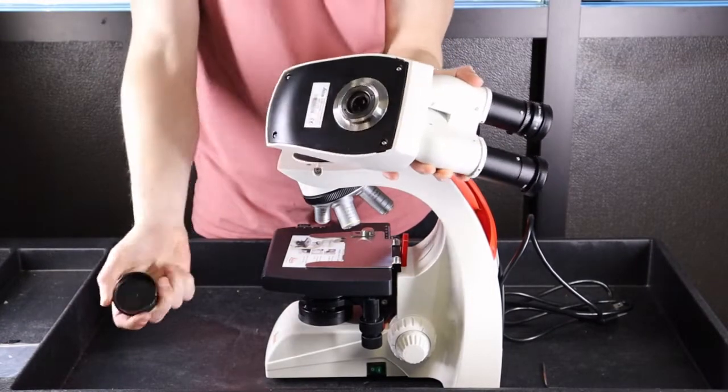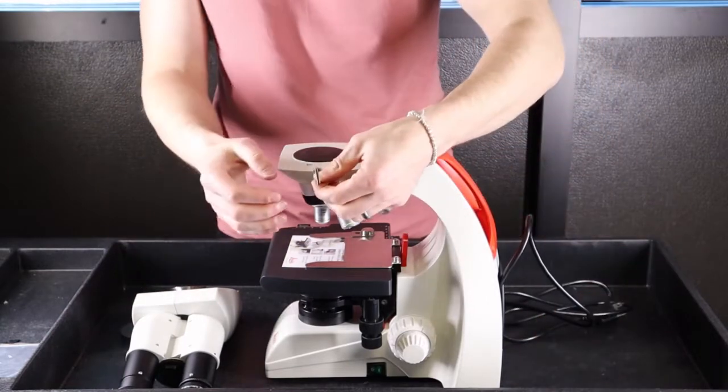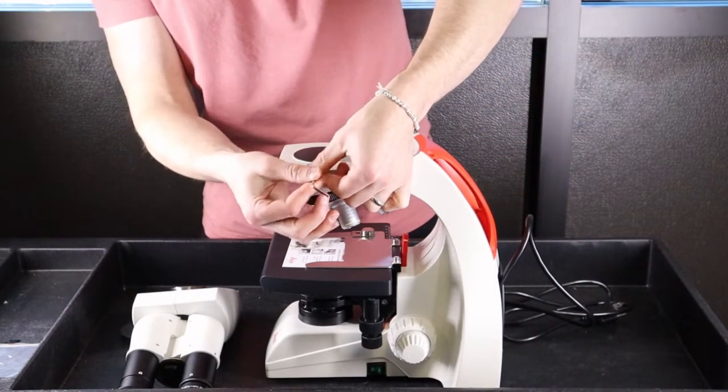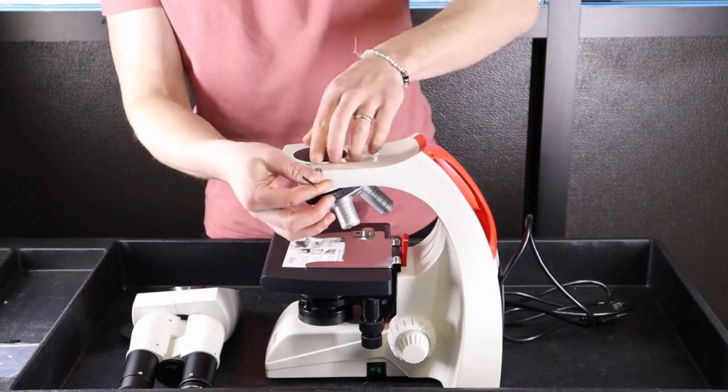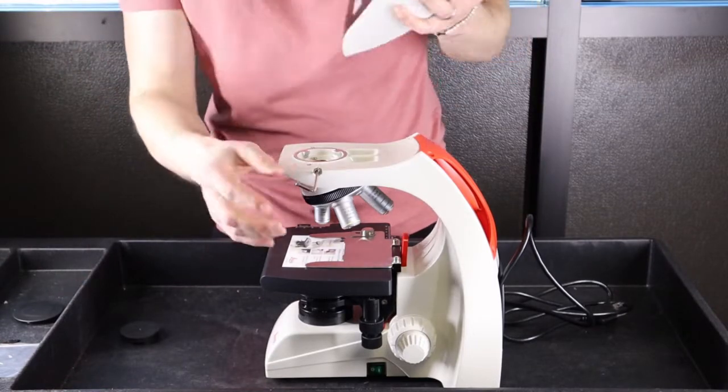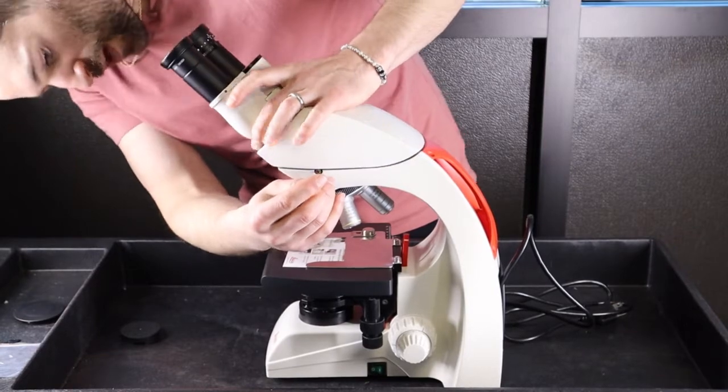Remove the black cap from the head. Take the Allen key and loosen the screw on the side here. Remove the black cap there. Take the head and hold onto it. Rest it on the flange.